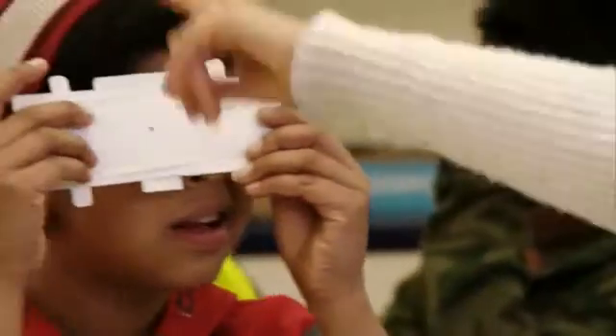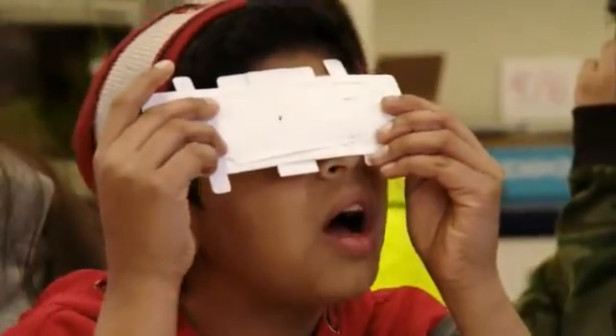We formed an entity, Foldscope Instruments, in December 2015. Part of our vision is not only to provide instruments to people around the world but also to connect them to each other. Within the next year we're going to build a million Foldscopes, and we're excited about bringing them out to the community.